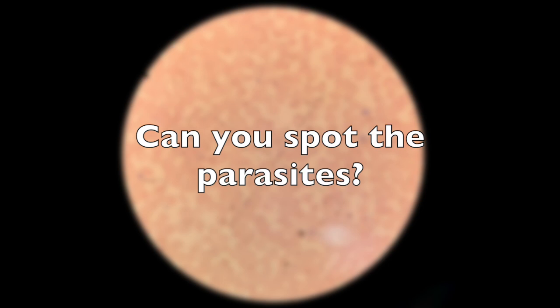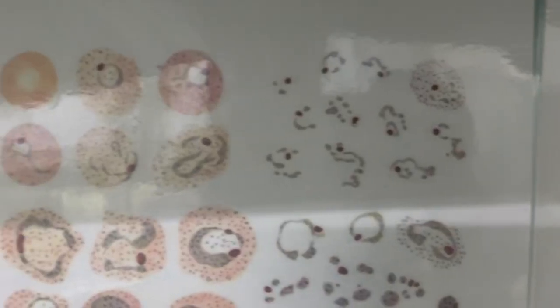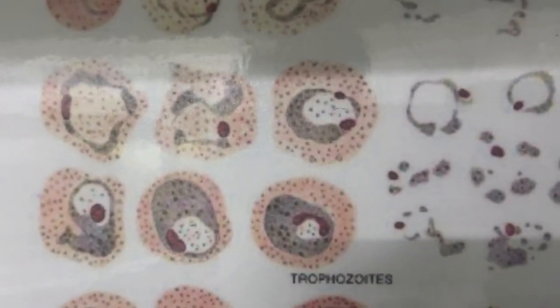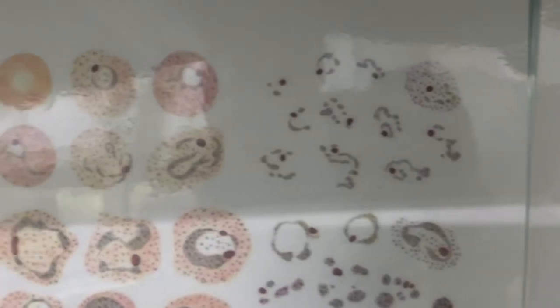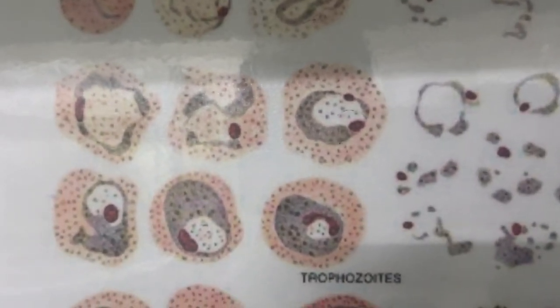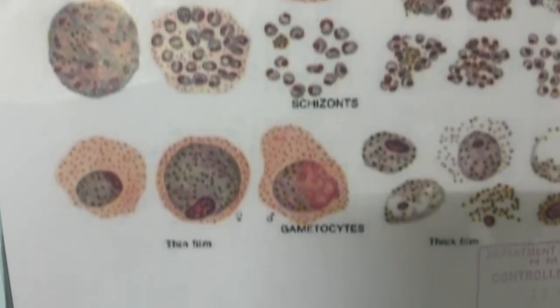You're looking for particular shapes and the purple staining from the Giemsa. The parasites may be at different stages of development: the ring stage looks like a ring; the trophozoite stage is sometimes described as a headphone shape. The first two rows in the reference chart show the ring stage, the third and fourth rows show trophozoite morphology, the fifth row shows schizonts, and the final row shows gametocytes.